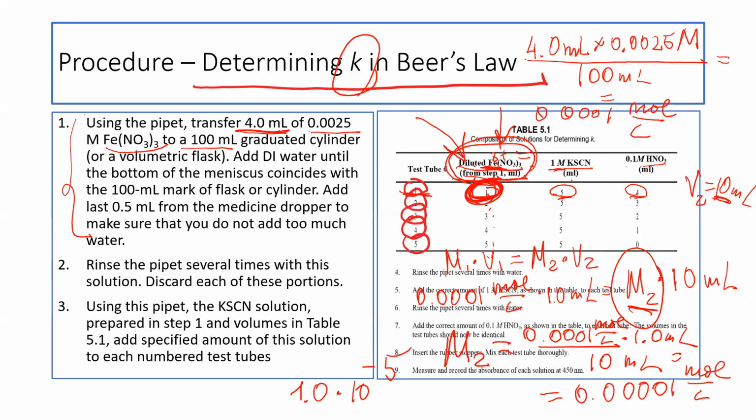So here also, guys, I'd like to make some corrections, because the volumes of solution are given like 1, 2, 3, 4, 5, and so on. It's not correct. I will use the volumetric pipette and actually will transfer 1.0, 2.0, 3.0, 4.0, 5.0, and so on.